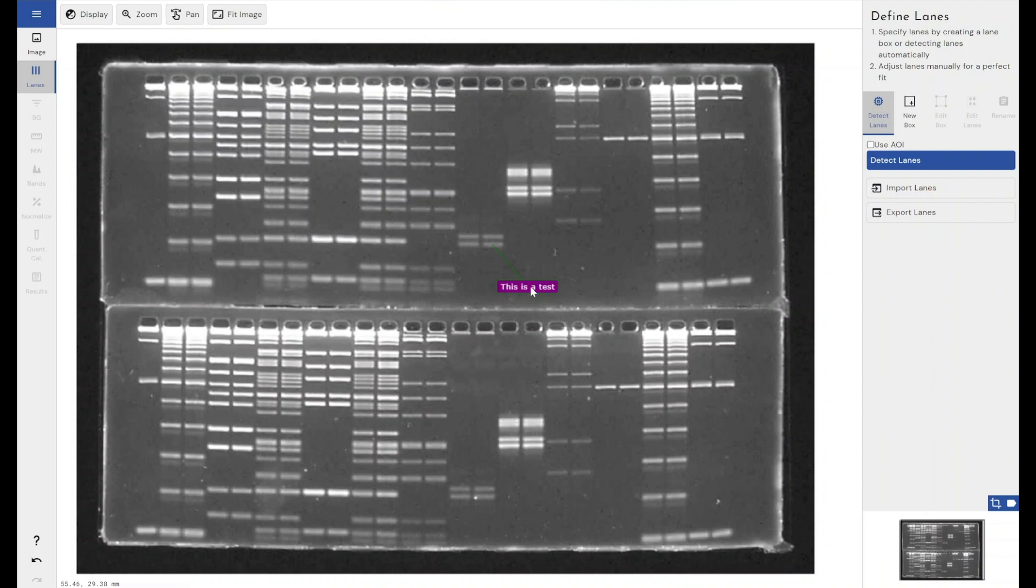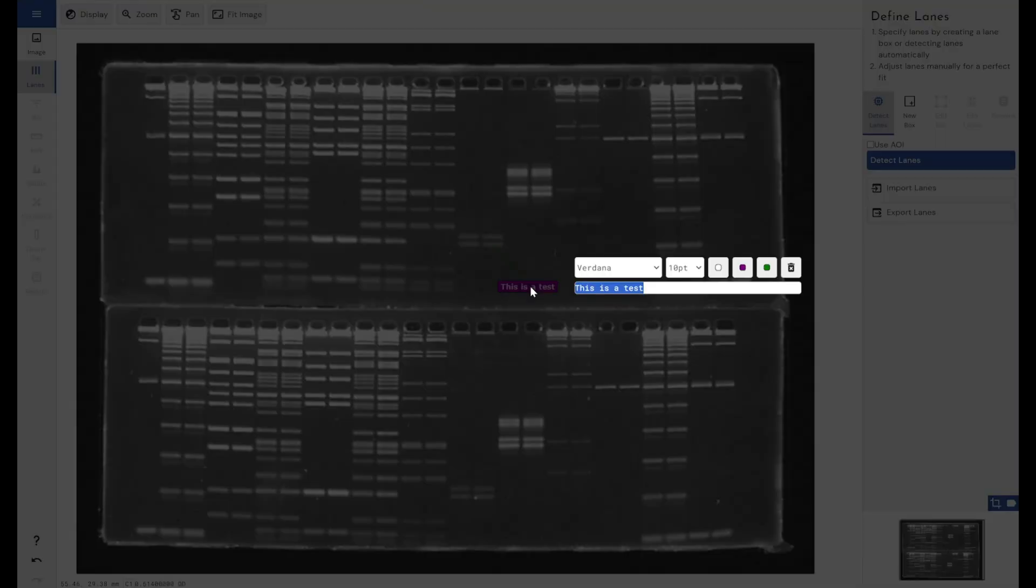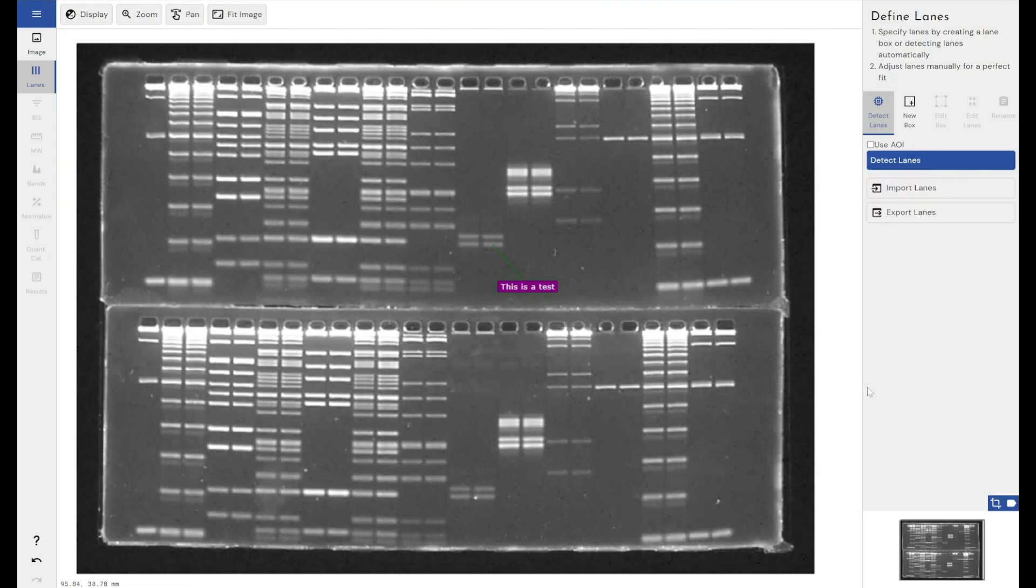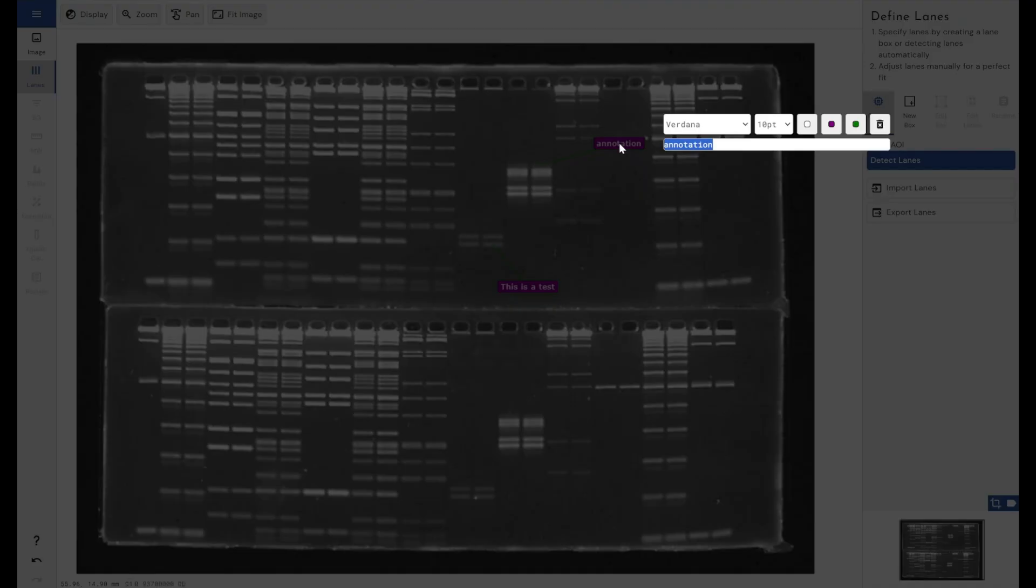If we did want to edit it, we can hold control and double click and get back into that edit mode. And if we want to remove this particular annotation, we can click on the trash can icon here.